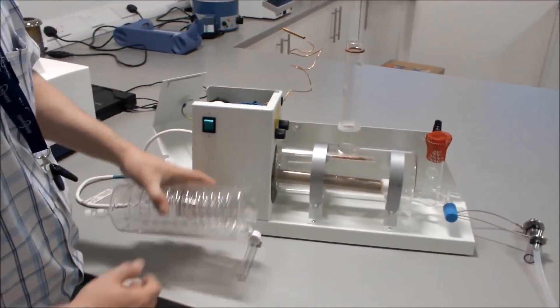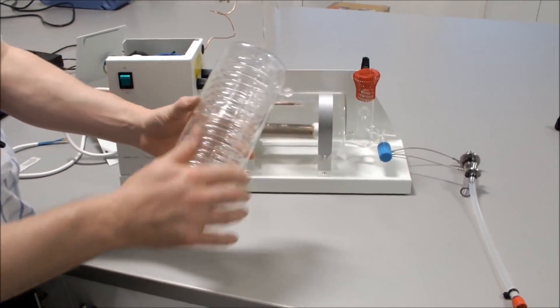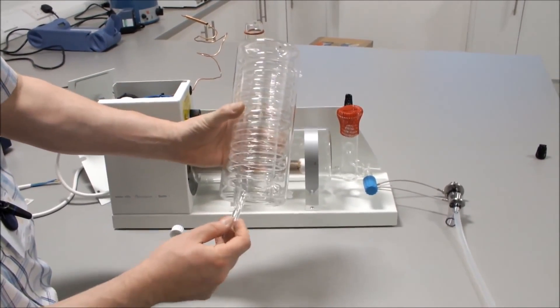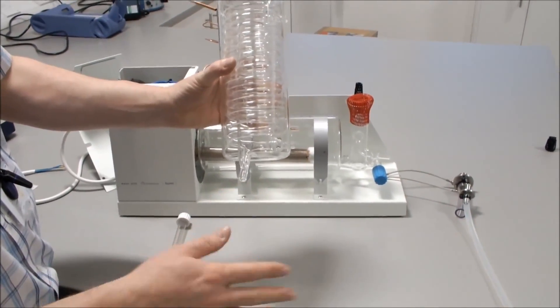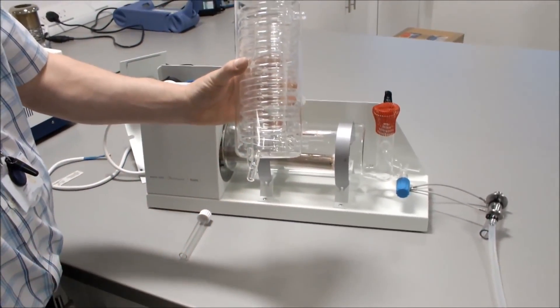We will then connect our condenser to our vapor tube. Before connecting, on the condenser outlet which faces the front, now is the time to connect your distillate output using 8mm or 9mm tubing secured with a tie wrap. Note that this tubing is not included with the kit.